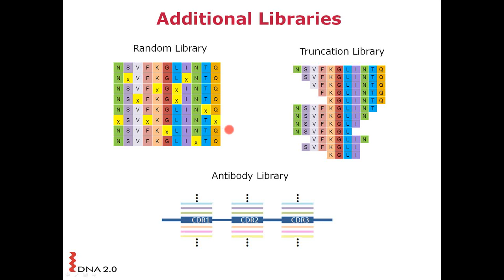deletions. So they tend to have a higher representation of useful random clones, but the mutations that you're getting are completely random. Like I say, these are reasonably priced, but at least in our view, they're not as useful because there's almost no design that goes into them. So you can't specify any particular area that you want to look at mutations in.